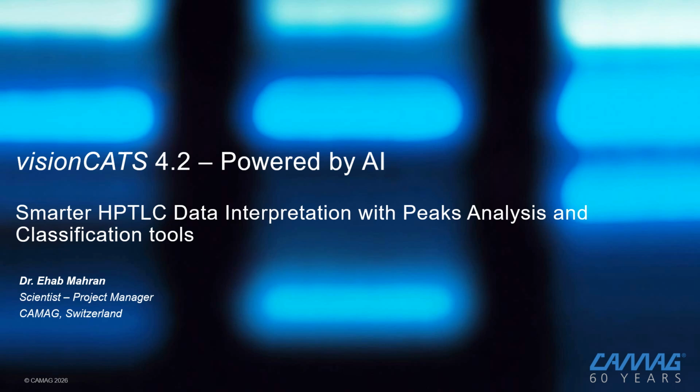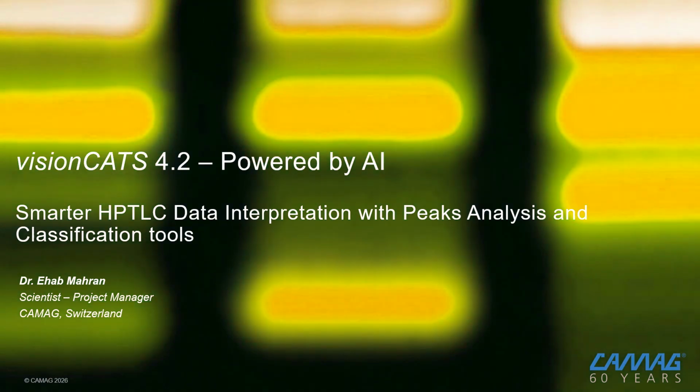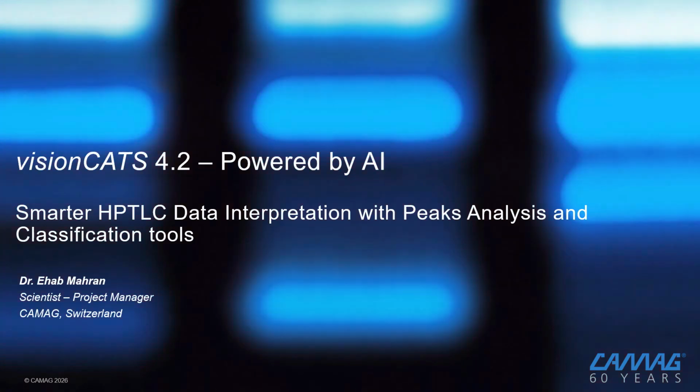Hello everyone, it's a pleasure to be with you today to discuss the next evolution in HPTLC. Today, we are diving into the new visionCATS version 4.2 with its new AI package tools. In this webinar, I'll be focusing on the peaks tool and the classification tool.